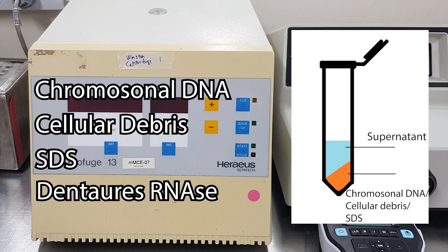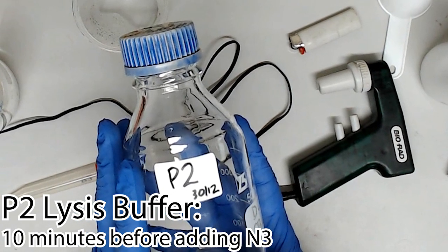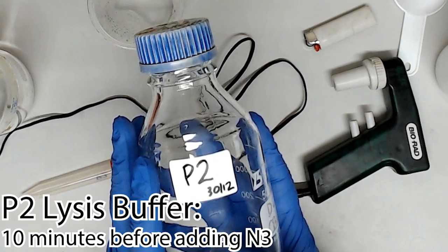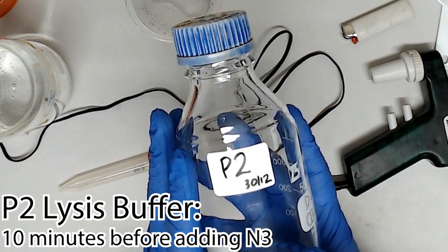This will also denature your RNases, so be sure to leave enough time for it to break up all the RNA. We used to only leave two to three minutes for lysis before adding this buffer, with a predictable result of highly RNA-contaminated purifications. Now we let the lysis buffer work for 10 minutes.